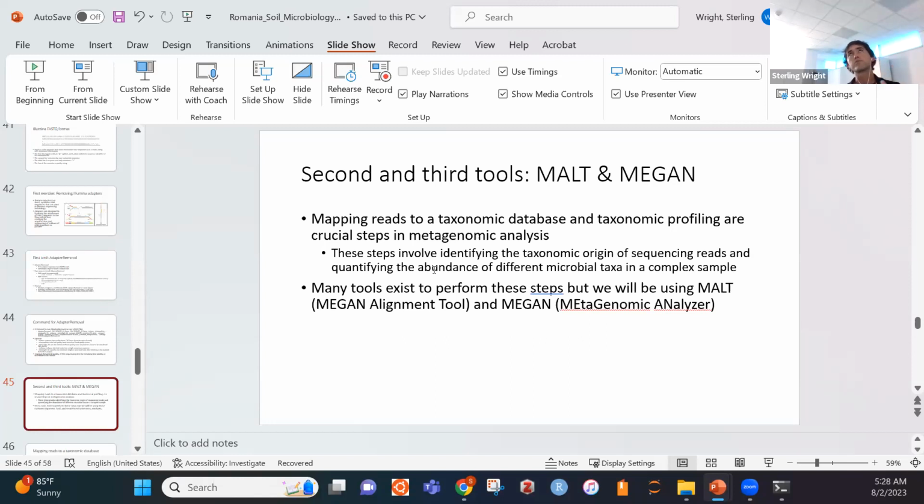And these are very crucial steps in metagenomic analysis. I would say this is another step where a lot of different research teams use different tools, different settings, different parameters. It's not necessarily early stages, but it's nowhere close to being standardized, with one way to do things that is correct. The important thing here is to know that there are trade-offs and pros and cons for different approaches.